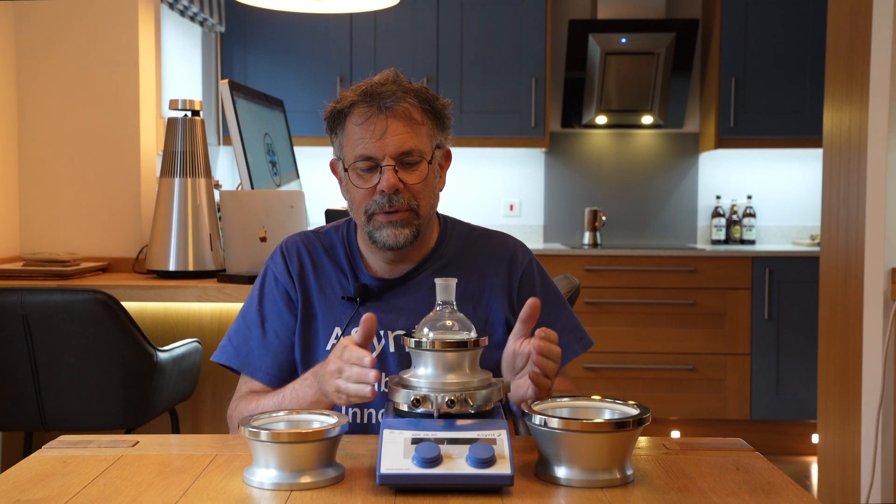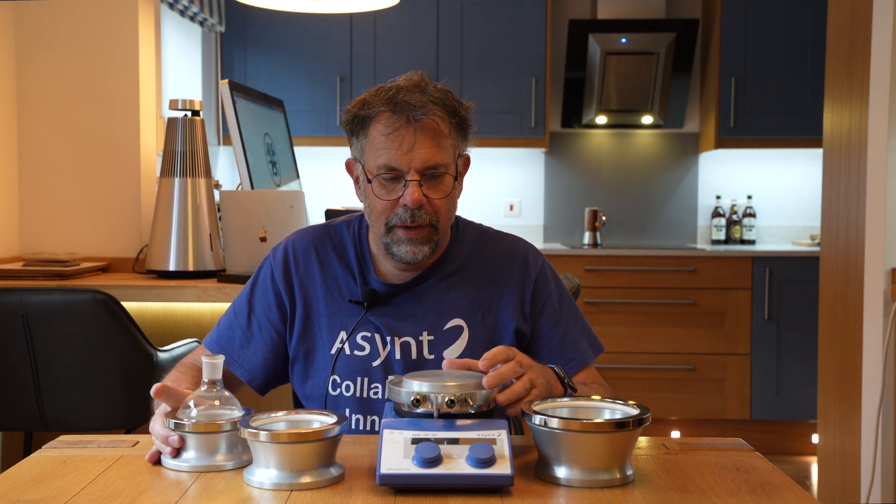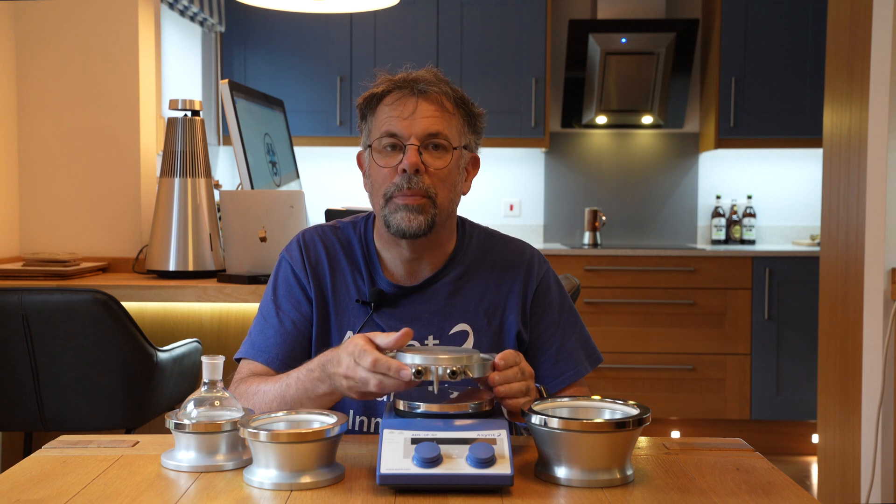So how does this work? Well, let me take this off. We have a multi-channel cooling base that sits directly on top of the hotplate stirrer, and then it connects to any type of circulator system you may already have — whether a chiller only, or a circulator system that can heat and cool precisely.